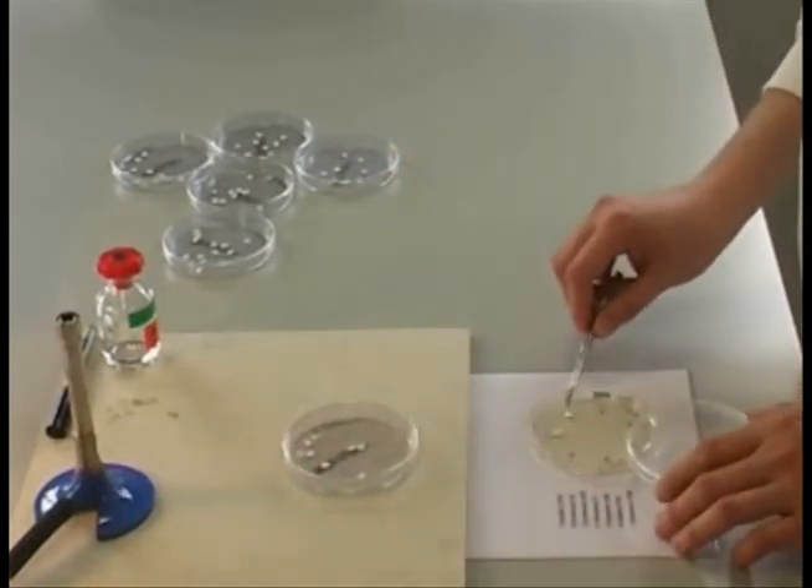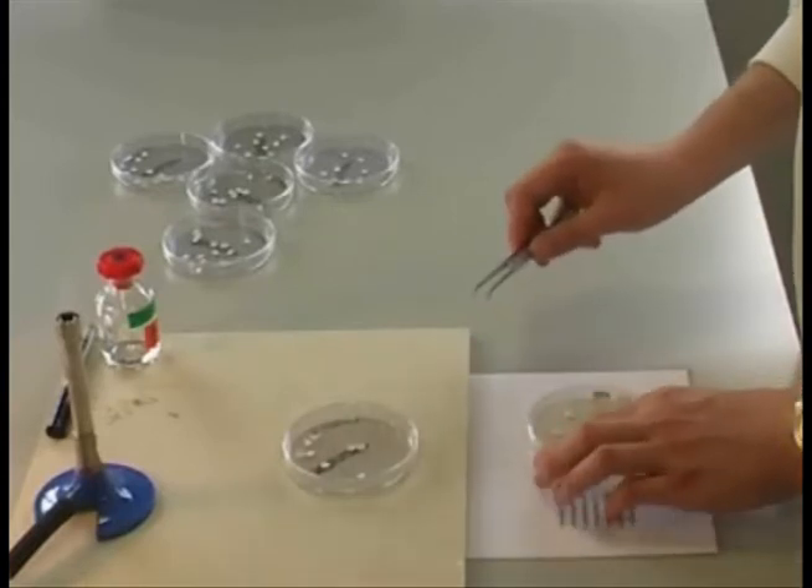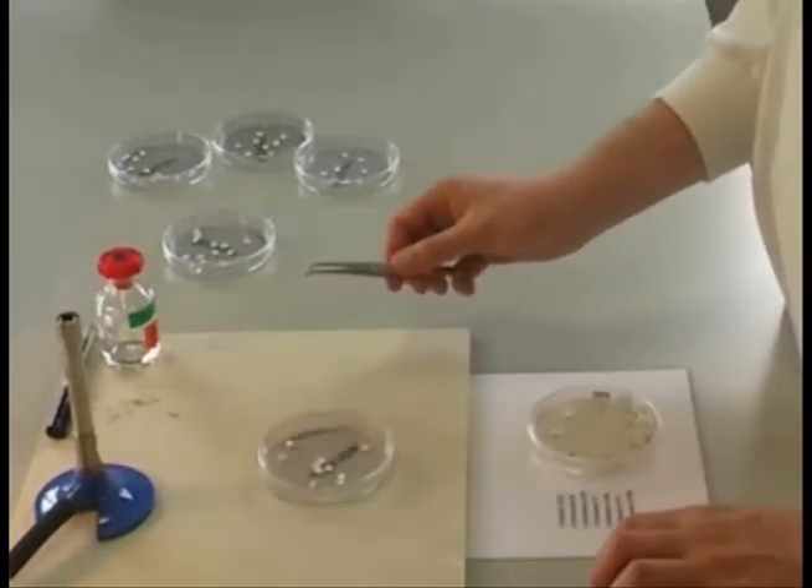Sterilising your tweezers between each disc, they should all be placed carefully, tapped down gently, and the whole procedure repeated as needed.